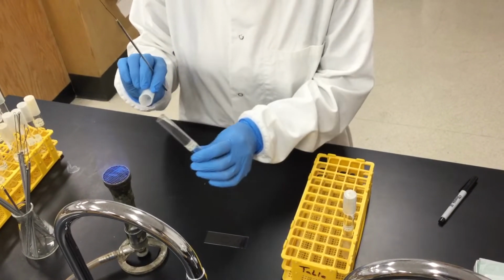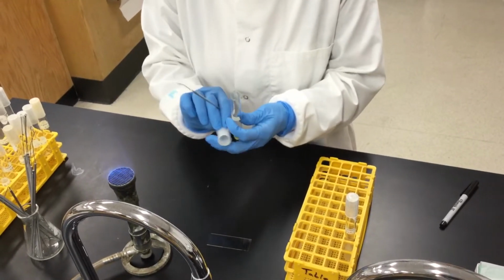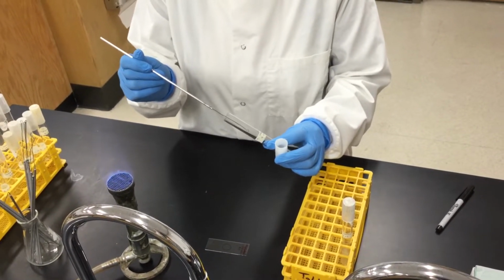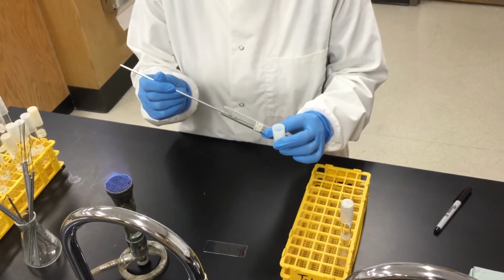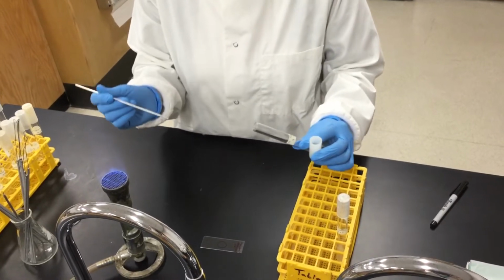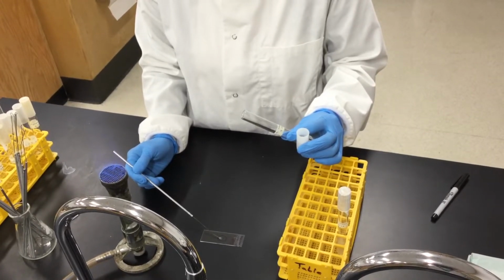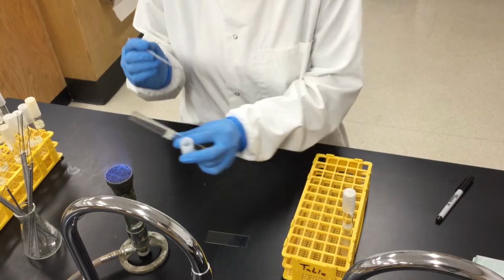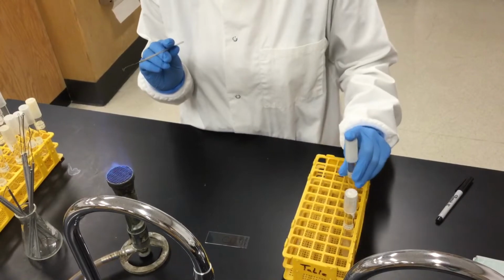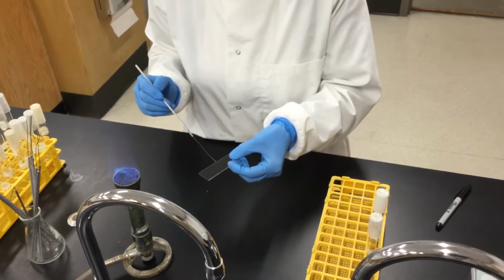You withdraw the cap like this, and then pass the opening of the tube and also the cap through the flame a couple of times like this. This is to prevent any microorganisms from being on the tip of the tube. And then holding it at a 45-degree angle, you introduce your loop, and grab a loopful of bacteria from there, put it here on the glass slide like this, and then close your test tube by flaming it again, put it on the rack, and then you will grab your glass slide.